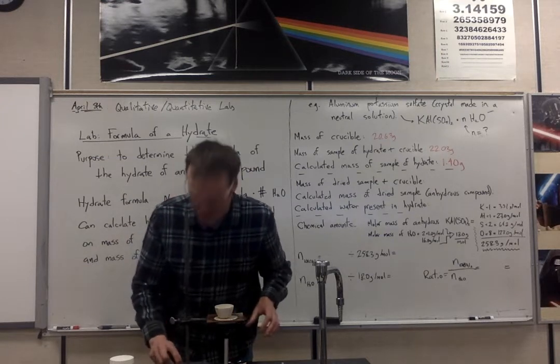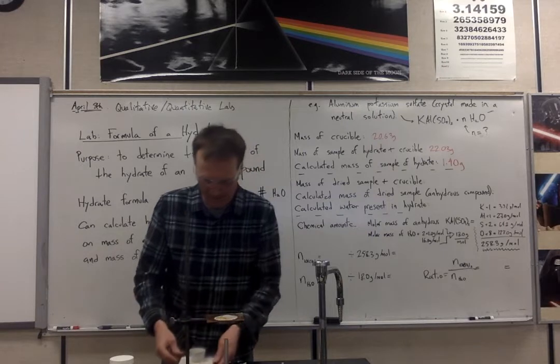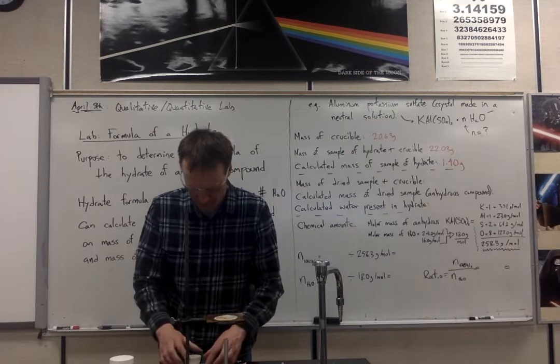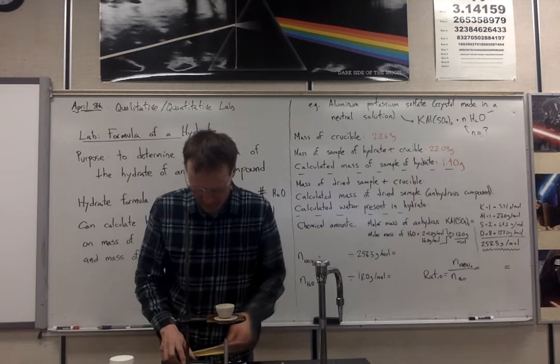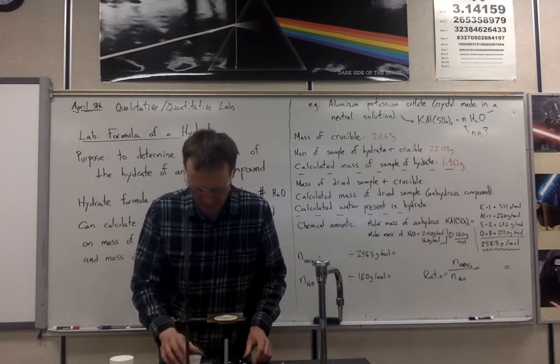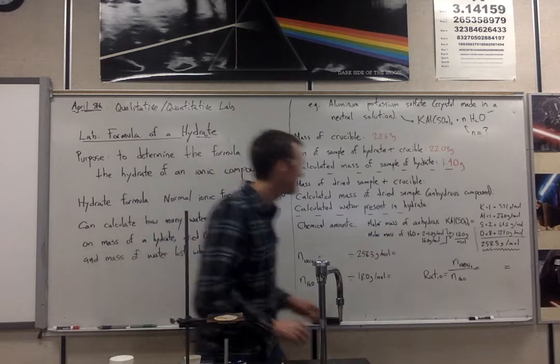I don't care about my fingers, but I don't want to do anything to my scale. There we are, 21.40 grams.